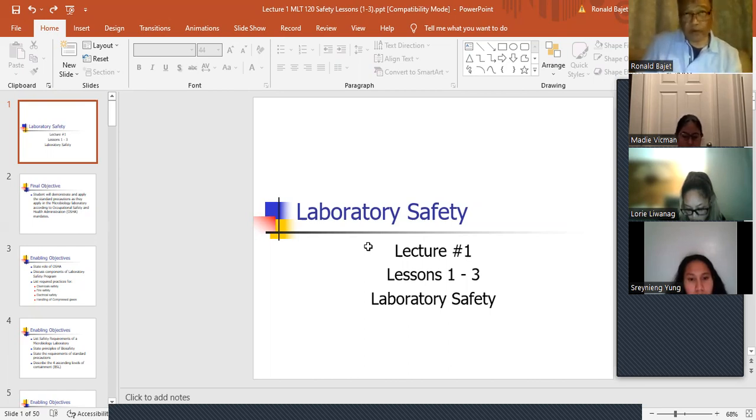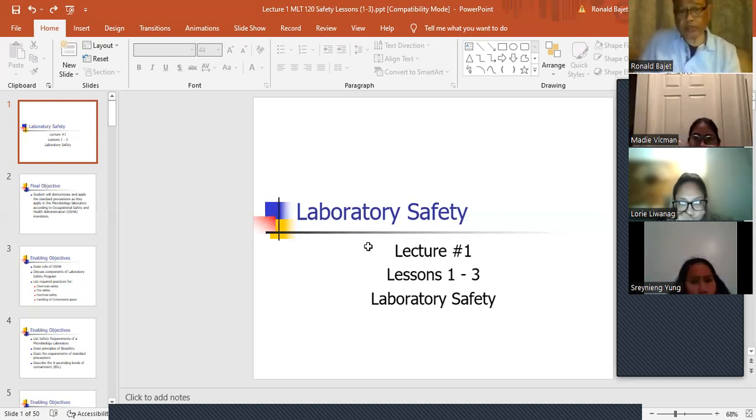Or I would say, this is what this looks like. It's junk. For example, a clean catch urine culture with three or four different colony morphology types. That's an easy one. That's junk. The rule is, if there are three different morphology types, then there's a lot of skin contamination there. It's not worth working up. But if it's pure, then you do work it up. I'll show that to you once we get into reading cultures. So that's something new that I want to introduce to you guys, because I don't want you to only know how to do a test.